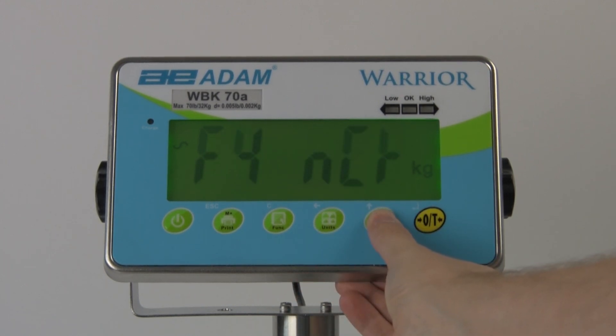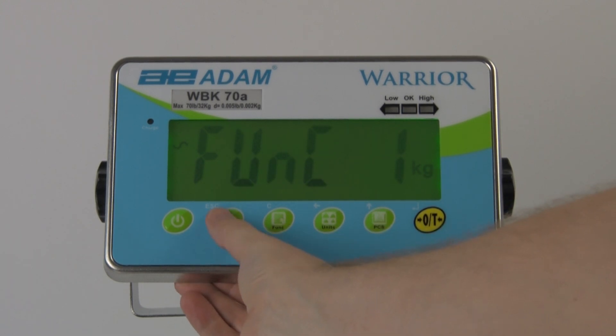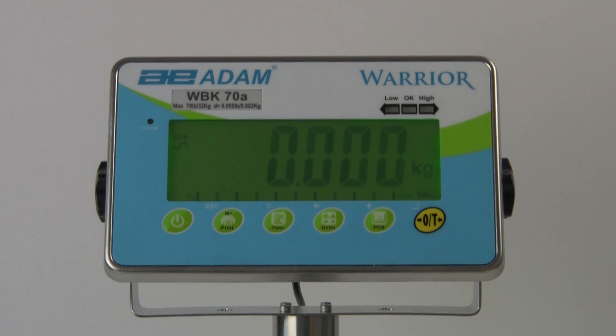Next, if you want to use the audible alarm feature, you can set it to sound when the sample is within the acceptable limits or outside those limits. You can also set the audible alarm to sound when a target is reached by setting only a low weight limit and setting the high weight limit to zero.